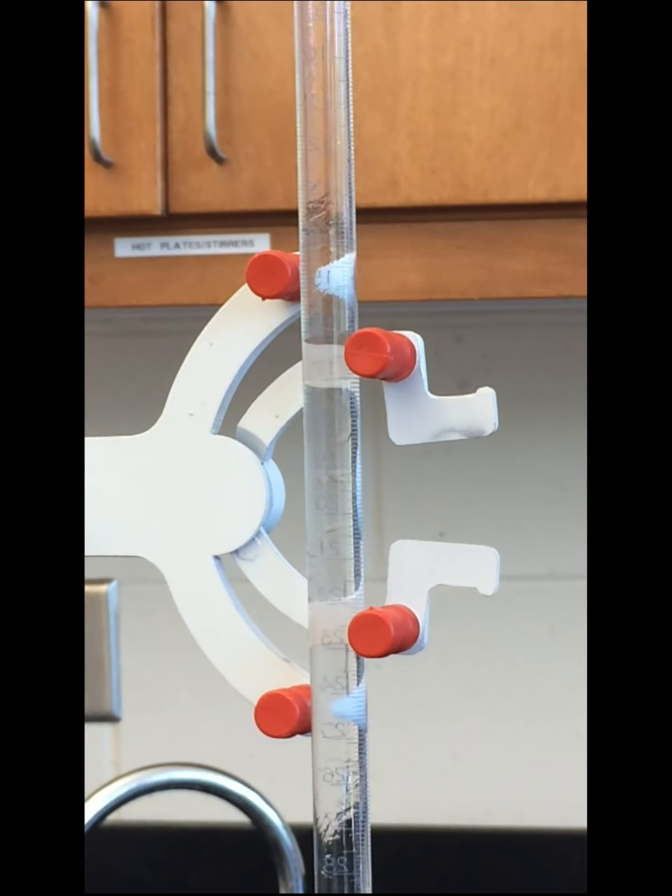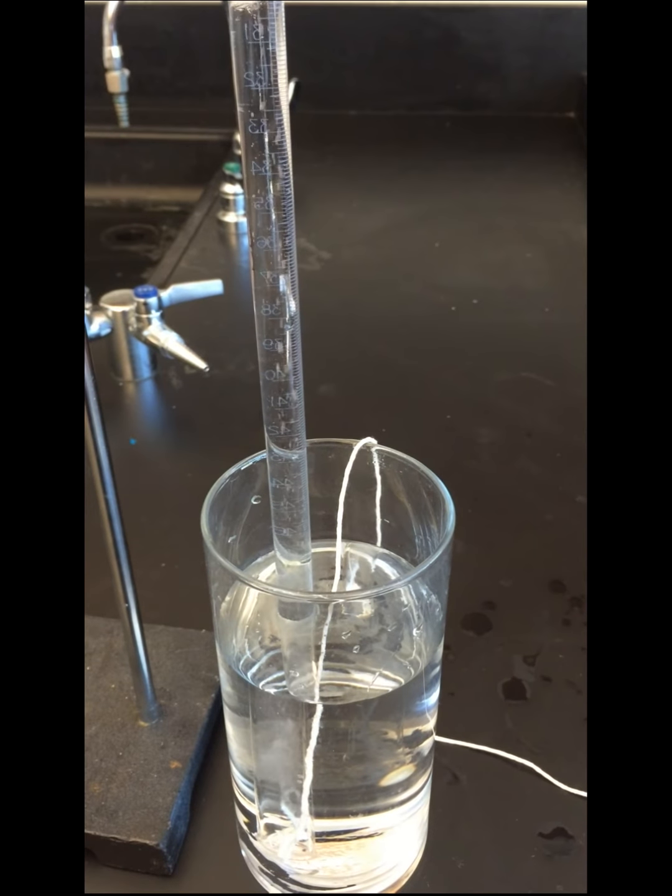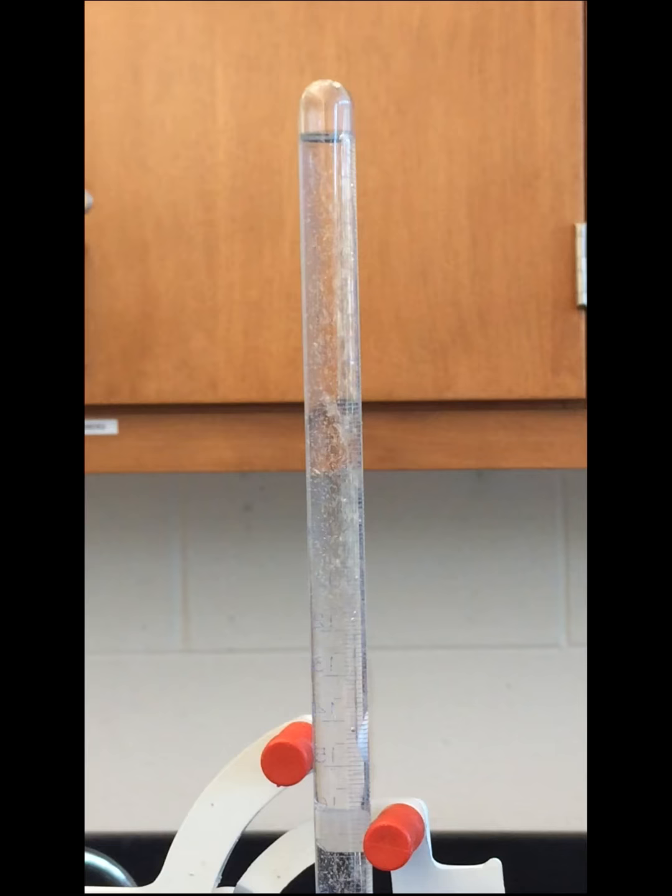A shimmering effect may be noticed due to the diffraction of light as the hydrochloric acid and water mix. Once the acid reaches the magnesium at the bottom, you'll notice that bubbles start to form. As the reaction continues, the bubbles will go to the top of the eudiometer. Trapped, they will force the water level further and further down.